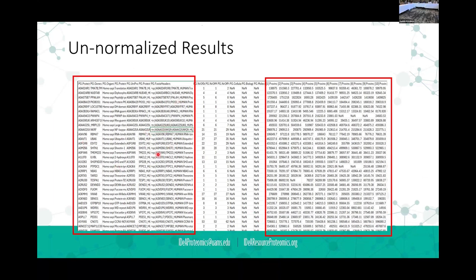It's not very pretty, and it looks like this, but it's really broken down into two parts. You've got the annotation data over here, again coming from our library. It tells us the protein groups, gene names, what the organism is, and gives the descriptor and all that kind of stuff. And then there's some other information, and we can download other columns sometimes if we're interested in knowing.